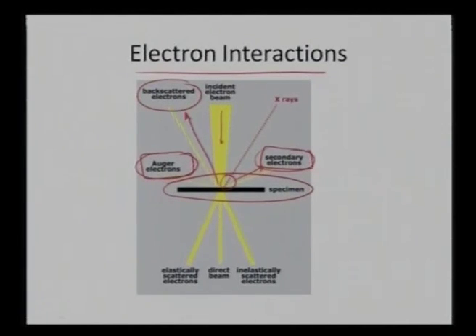They can also interact with the material to produce something called X-rays. So, we can see that everything is happening where the electrons or signals can be detected back above the sample regime. They are not allowing the electrons to pass through the material.